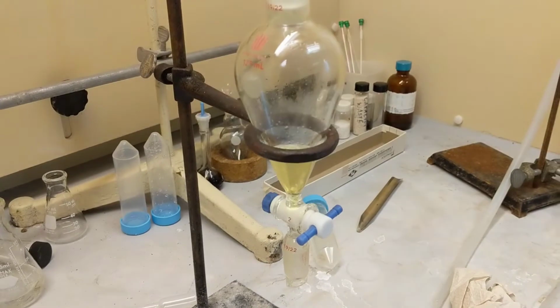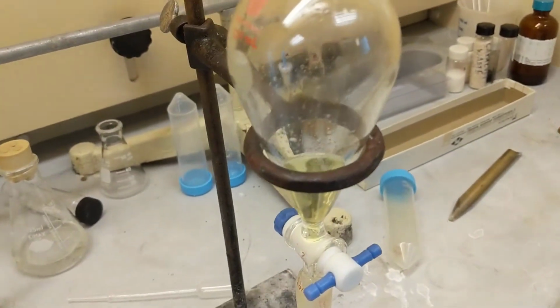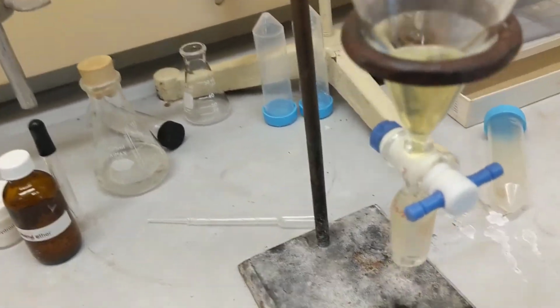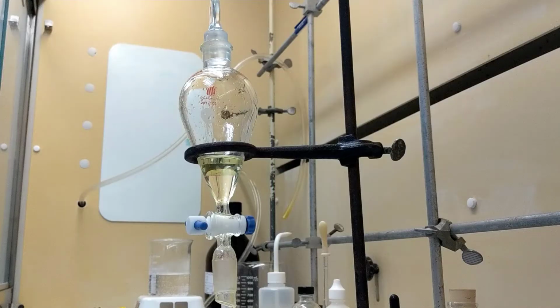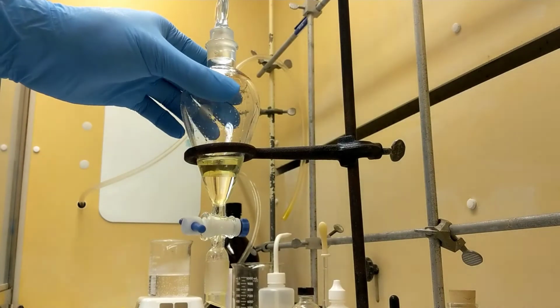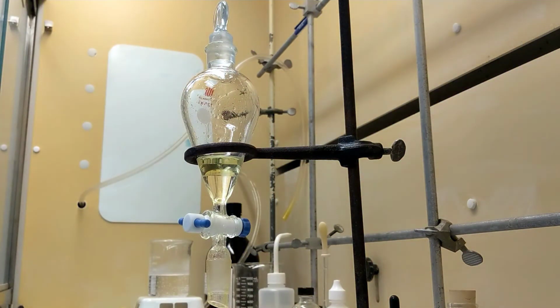Okay, now we're going to start drying this ether. But before we do that, we have to add 5 milliliters of supersaturated NaCl before we can start drying it. Alright guys, I'm back from adding saturated NaCl, which you can see there at the bottom. I shook it up like I did all the other ones. Release gas, shook it up, release gas, you get the idea.